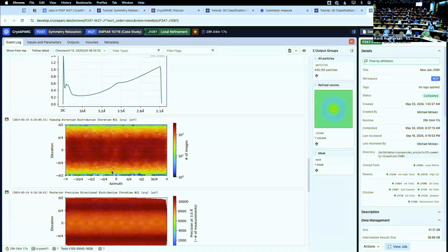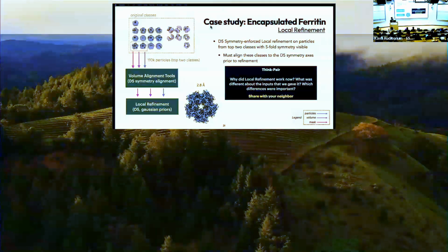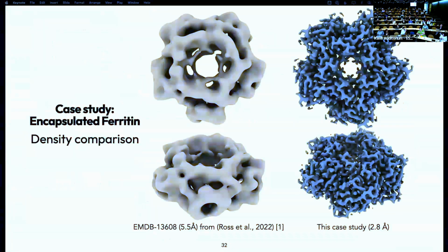Is that a protein? So I admittedly know very little about the actual biology. Based on your slide, it stated about 5.5 angstrom at the end. Is that correct? Oh, yes. At 5.5 angstrom, the cargo goes to 2.8 angstroms at the end, and it's ferritin of some sort.